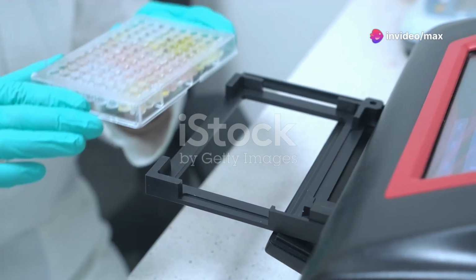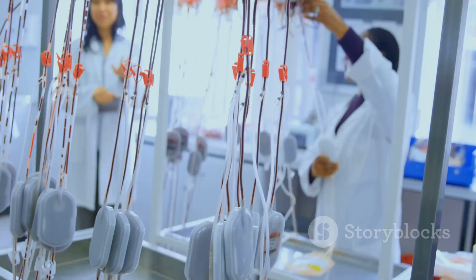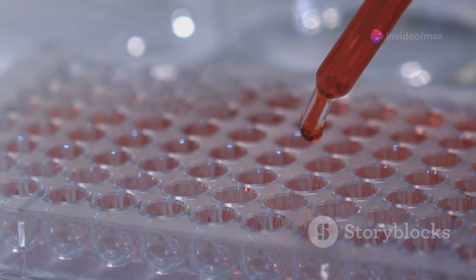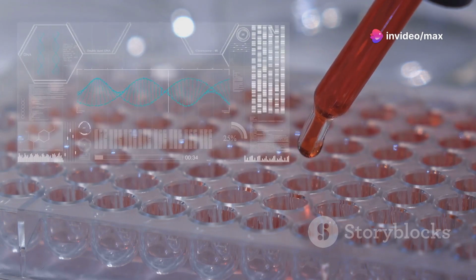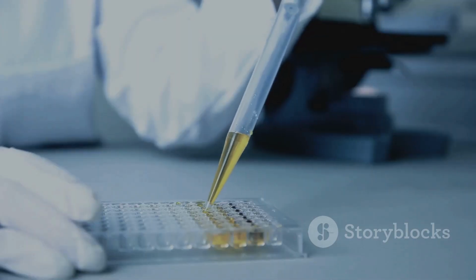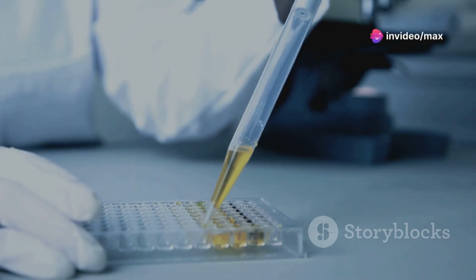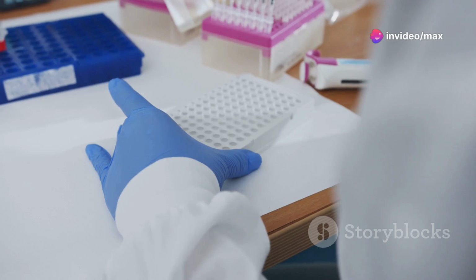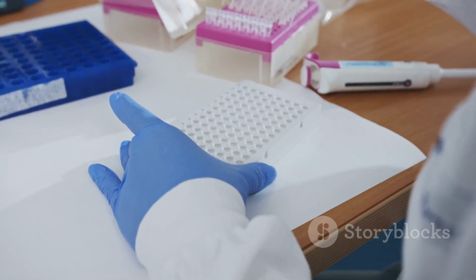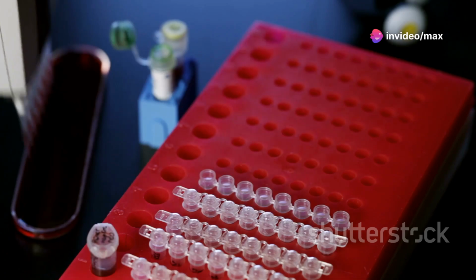Section 8. Competitive ELISA Procedure. Unveiling the competition. Let's delve into the step-by-step procedure of competitive ELISA. First, the antibody specific to the target antigen is coated onto the wells of a microplate. Second, the remaining surface of the wells is blocked to prevent non-specific binding. Third, the sample containing the unlabeled antigen and a known concentration of labeled antigen are added to the wells simultaneously. They compete for binding to the immobilized antibody.